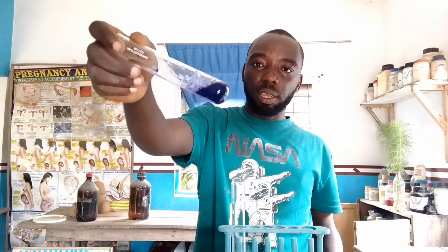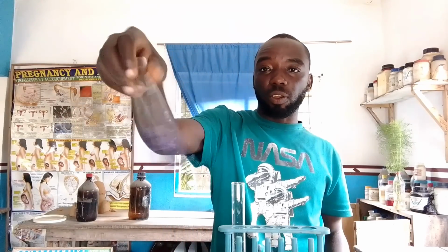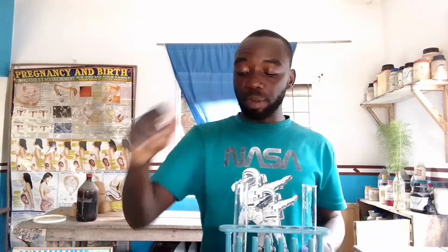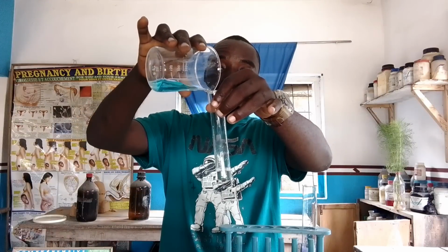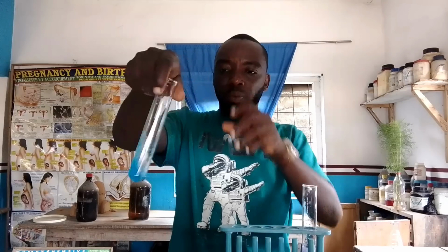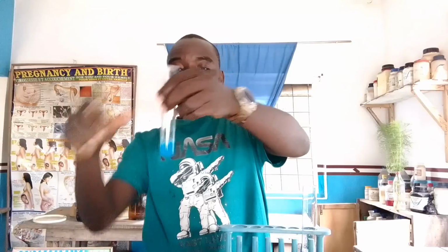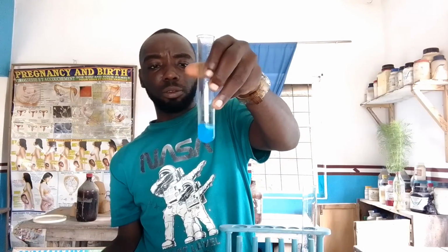Okay, so you can see there is a color change, and this color is purple. So the color we have here is purple, and let's still do the same thing to specimen H. Now when you do it to specimen H, you will discover there will not be any color change in it. Check it very, very well.